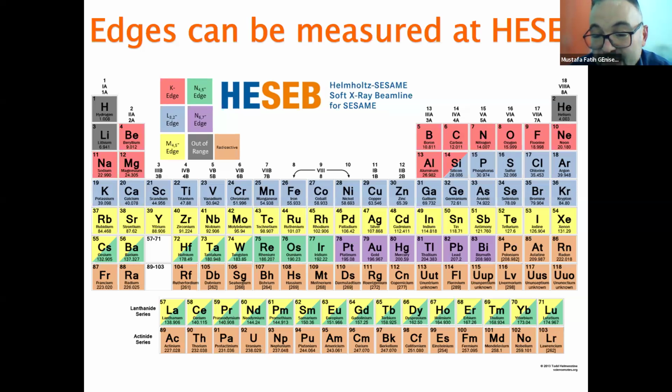in the world. There are very limited numbers of beamlines working with phosphorus K edges, because we call it neither soft X-ray nor hard X-ray. It's tender X-ray. It's in the tender X-ray regime. Phosphorus K edges and sulfur K edges are in the tender regime. In SESAME, there is no other beamline which can cover these elements.